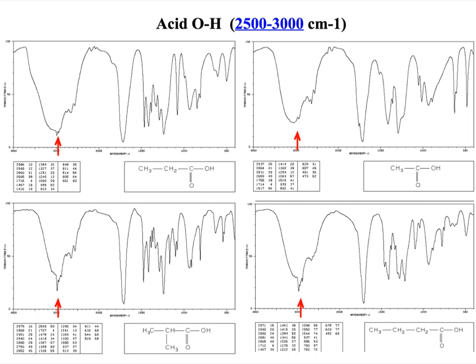If you look at the acids, they're quite similar. They've also got this broad, deep peak for the OH, but can you see it's shifted to the right? If you flick back in the video, you can see that the alcohols are slightly to the left. Also, in all of the acids, the OH absorption peak joins up with the CH peak, so you get this very distinctive shape. You should just be able to spot this shape in an exam, with barely any thought, and say that's the acid.